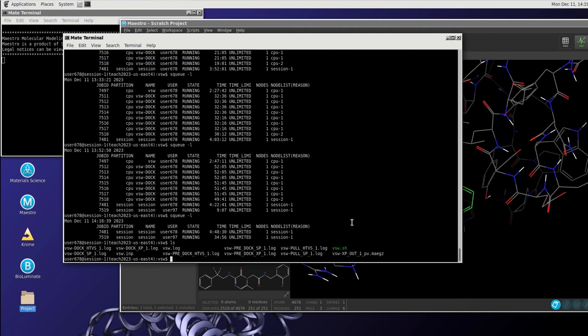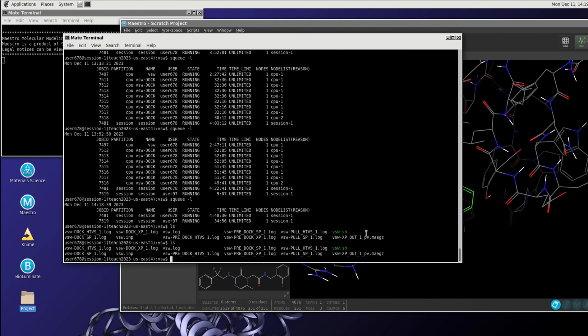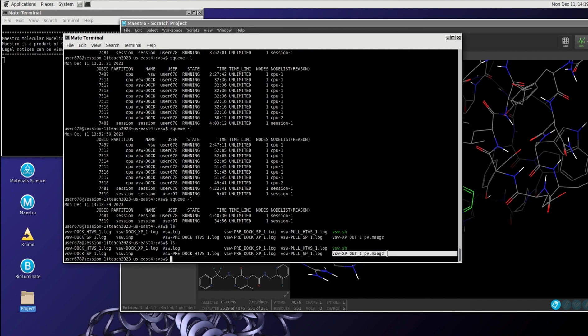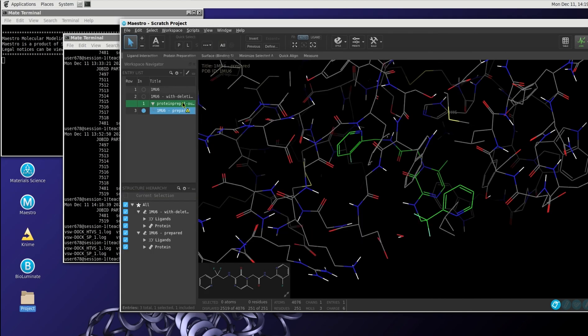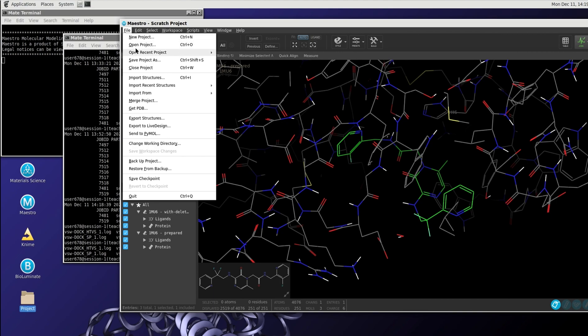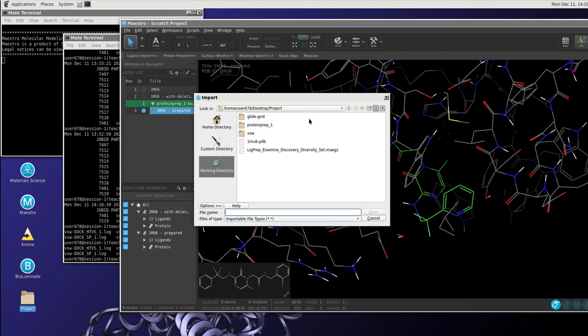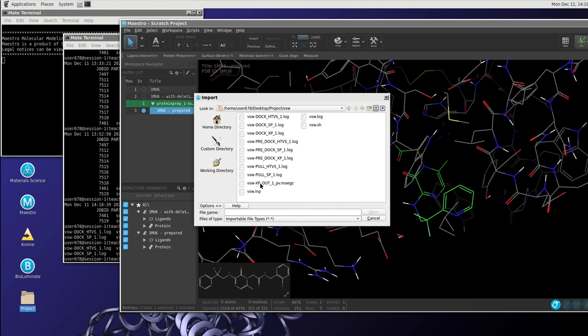Three to four hours, the docking is finished and you should see if you type in ls in your directory where the virtual screening workflow was executed. You can see a number of files and one of those files which contain the compounds is this MAEGZ file, the output file. So we can load that into Maestro. We go to the Maestro and we load those compounds. We do that as follows, import structures.